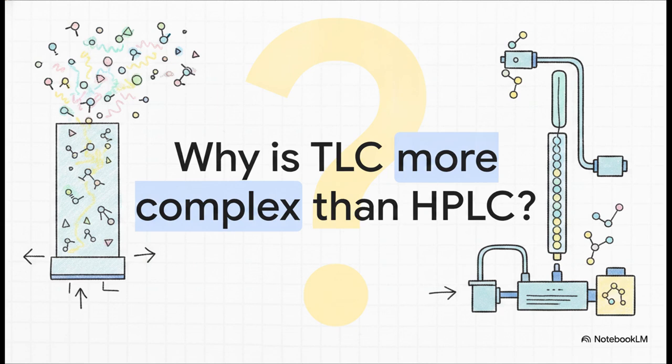But here's the million-dollar question for today. Why is this supposedly simple technique actually way more complex under the hood than a highly automated setup like high-performance liquid chromatography, or HPLC? What makes this little glass plate so incredibly chaotic on a molecular level?